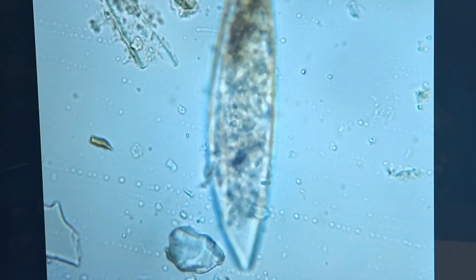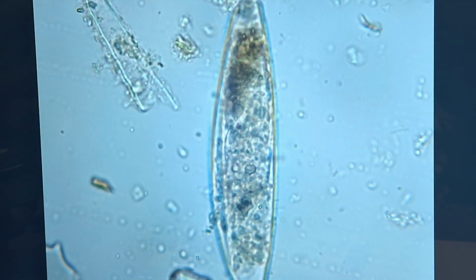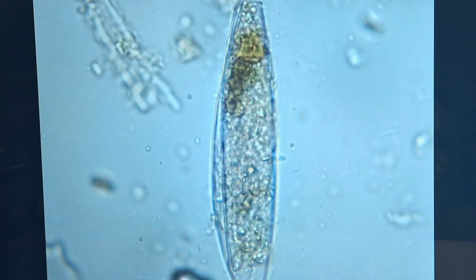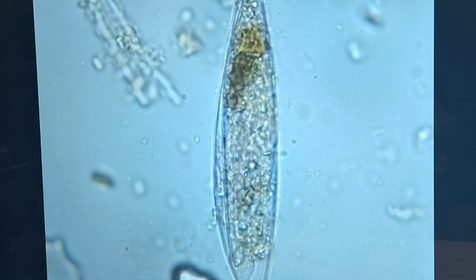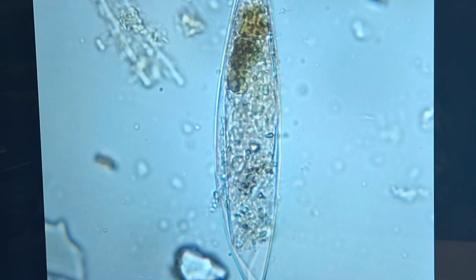Here we have another shelled amoeba. Another protozoa. It's a shelled amoeba. So that second level above the bacteria and the fungi. Now we're up in the protozoa. You see the mouth on this end. The insides, whatever's been consuming.